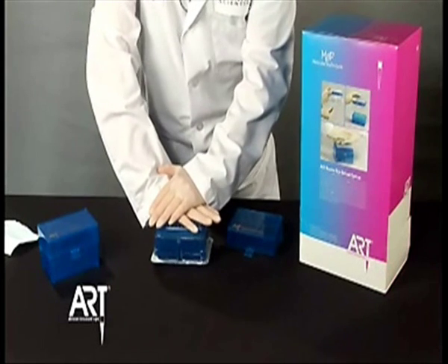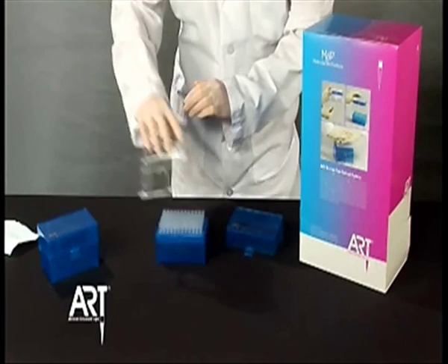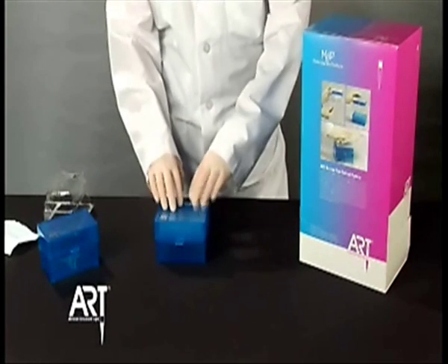Push down firmly on top of the blister tub, locking the insert into place. Remove the blister tub, snap the lid on, and you're ready to use your tips.